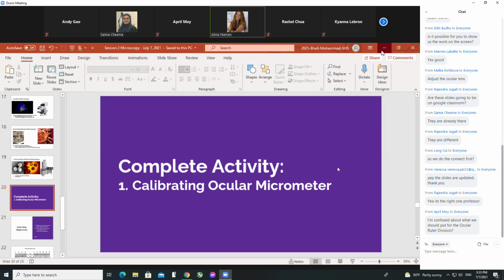Professor, I'm sorry, I have one more question. I see in the video for the agar plate, she used one tube for 2 Petri dishes. So how many tubes should we have for a slant, like a culture swab? What we're going to be using for the first lab, right? And for that you need, I believe, 3 petri dishes. Let me just confirm that, okay? Because I read it yesterday and I just want to make sure that I'm giving you the most accurate information. Give me a few minutes. Okay.